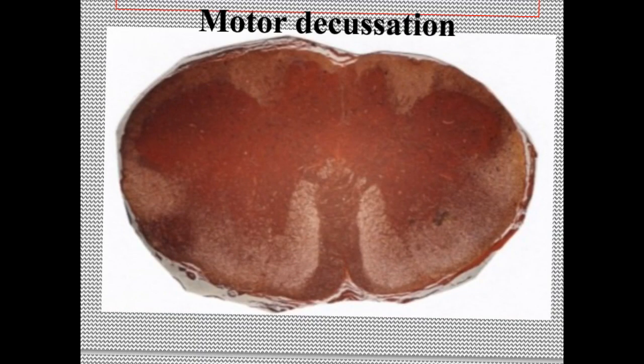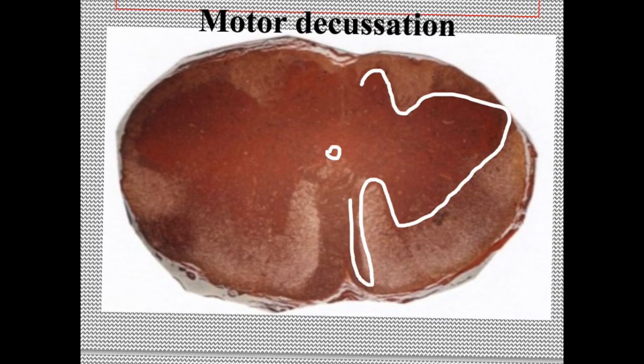This slide actually here does not show a central canal, but actually it is present in the section. We have a canal. So when we have a canal and the gray matter is not H-shaped, so it is closed medulla. How to differentiate between the closed medulla, motor decussation, and closed medulla, sensory decussation? If you look here, you will notice that we have a bird here and his lower limbs here. This is like a beak for this bird.